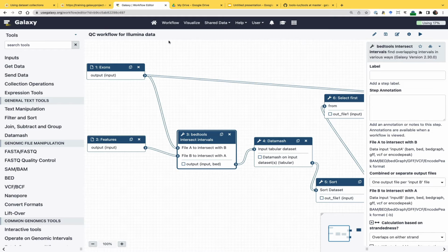One of the things you can do is run this workflow through the graphical user interface. You just click run. But many people who do analysis at scale create a workflow and then, for example, want to run it 1,000 times. For them, doing this through the interface is annoying, so you can do this programmatically. You just give it a workflow ID and where to run it, for example on a US instance, a European instance, or an Australian instance. All these are open public instances, so you can submit large analyses to them for free.